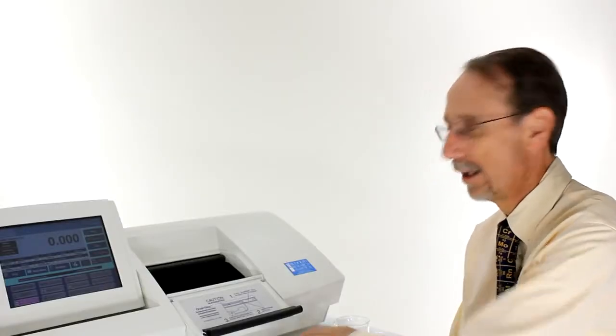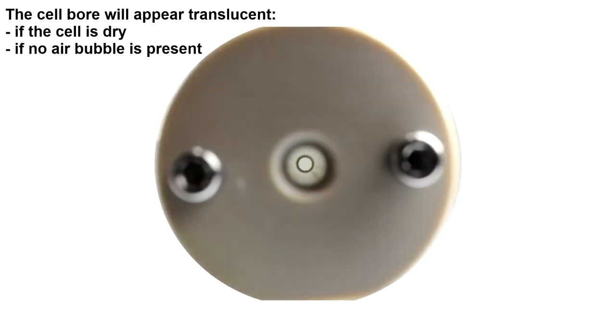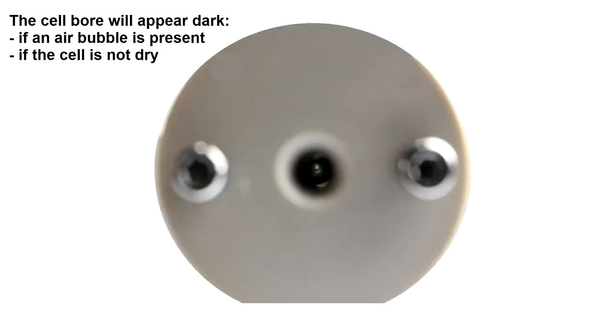First check that the cell is empty and dry. The easiest way to do this is to look down the cell, hold it up to the light and look along the bore.